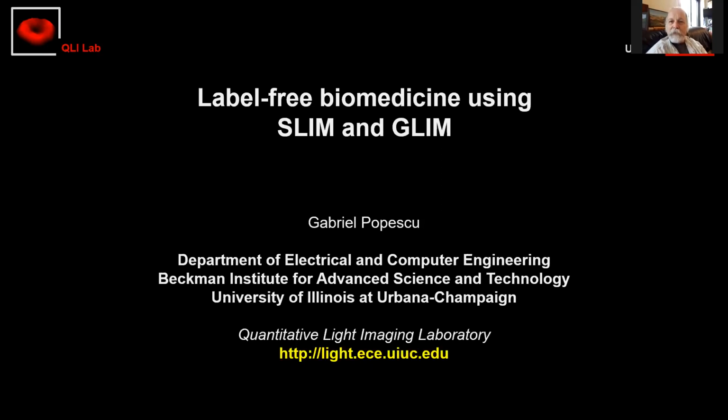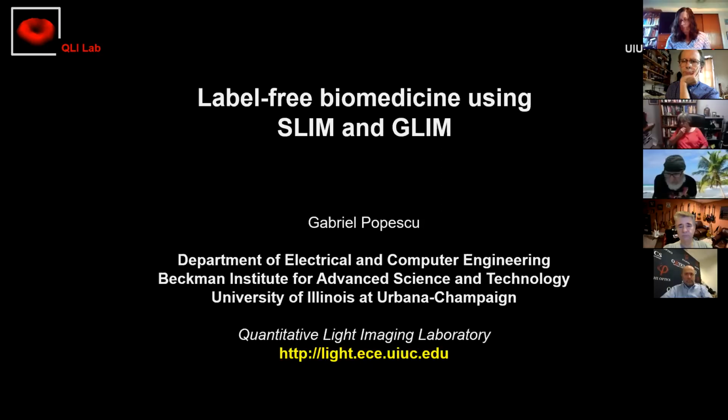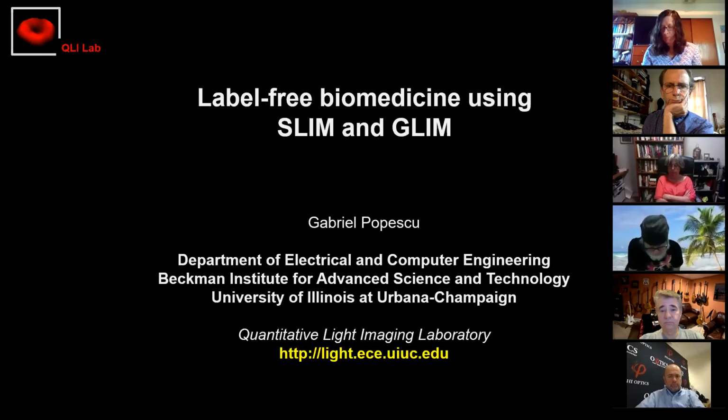So for me, often this will be metallurgy, but people are looking also at different kinds of sections of stone and also parts of paintings. The traditional thing is to have cross-sectional samples that are cut, but we're also very non-destructive oriented in art materials research now. Do you have any just off the top of the head comments to what I'm talking about?